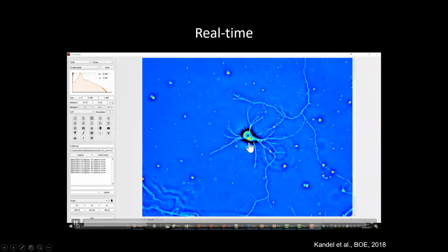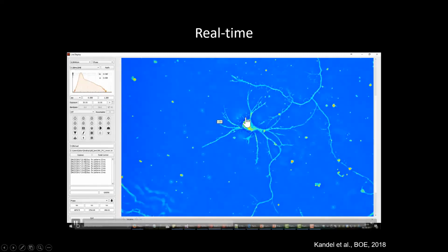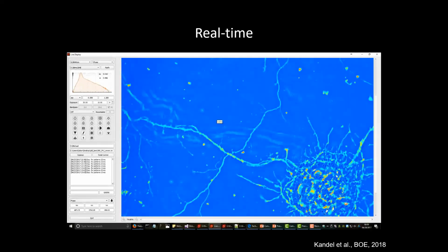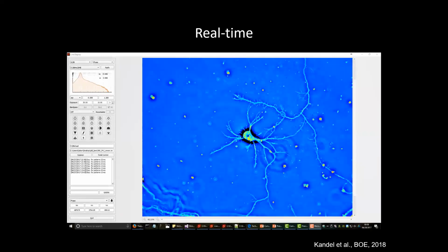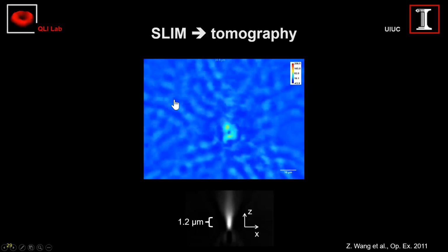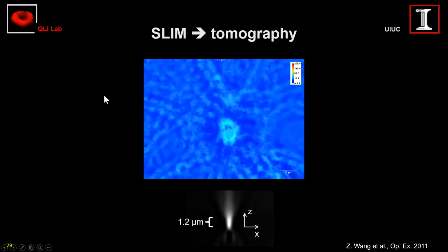And this is the original SLIM coming from phase contrast, from Zernike's halo. Then you push a button and it's numerically reversed. Just because we have access to that full information, we have access not to just one frame, we have access to everything that is in that image, the full 4 frames. So anyway, it was an interesting problem that combines scattering with coherence and so on. So as a byproduct, we kind of fixed Zernike's halo from 1935.